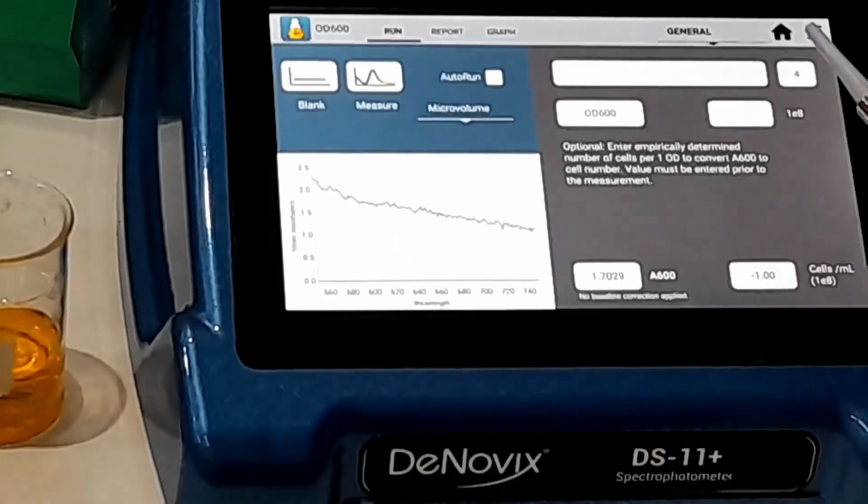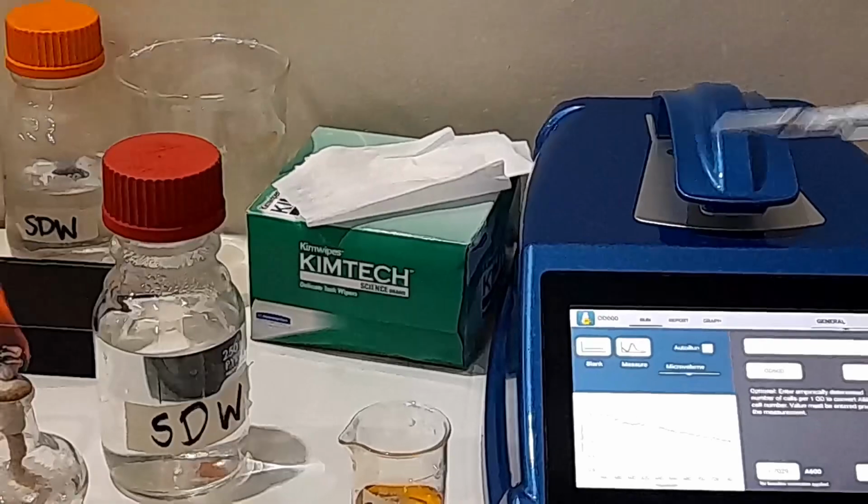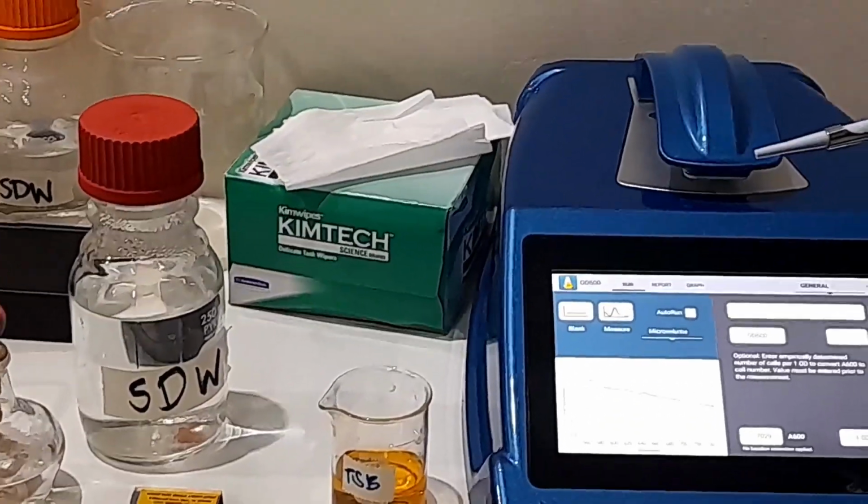So let's say, for example, it's between 1 to 2, right? If the reading I got was 4, if I had a reading of 4, what would I need to do? How much?